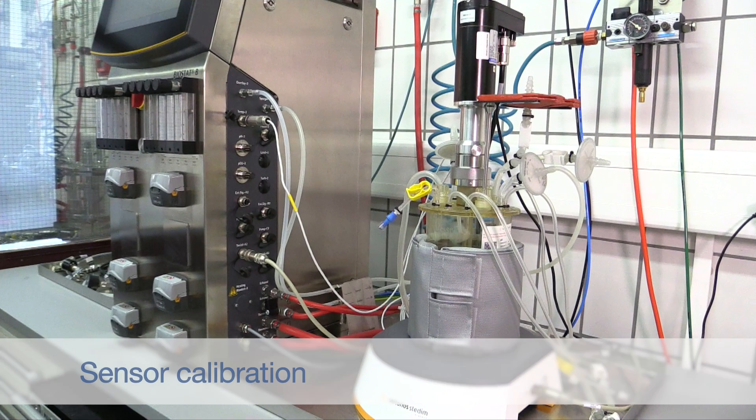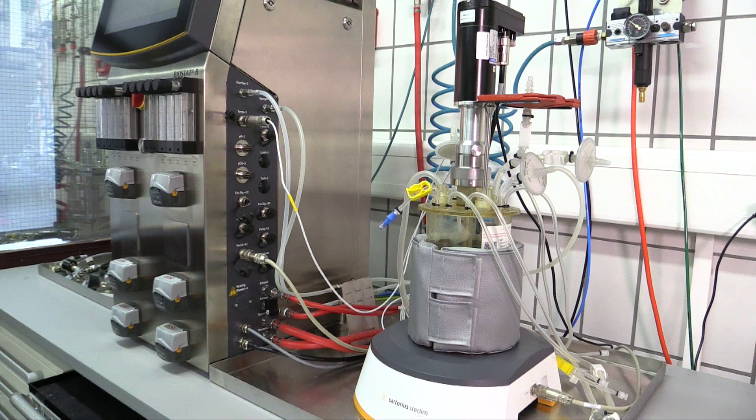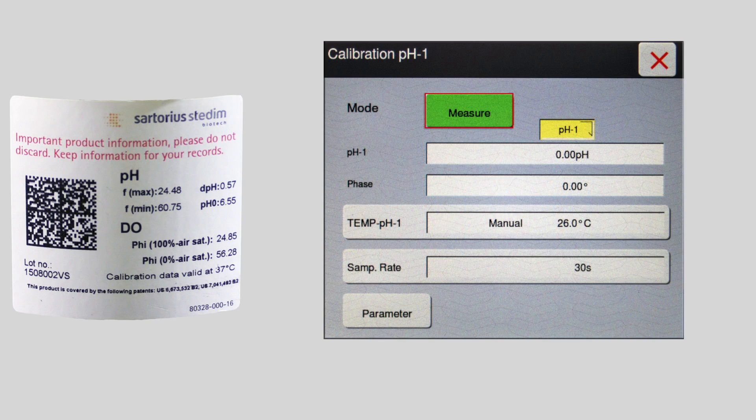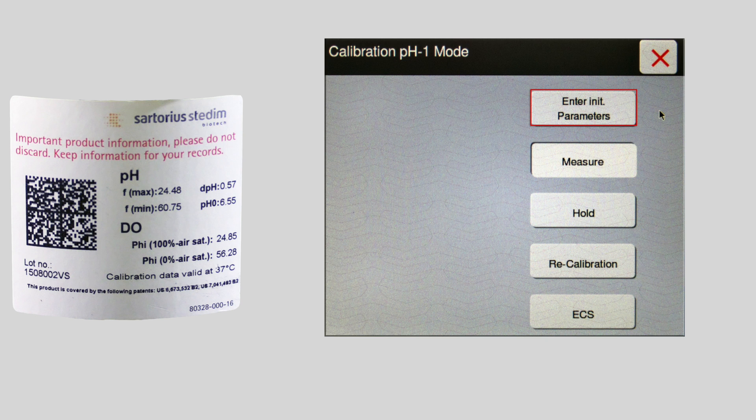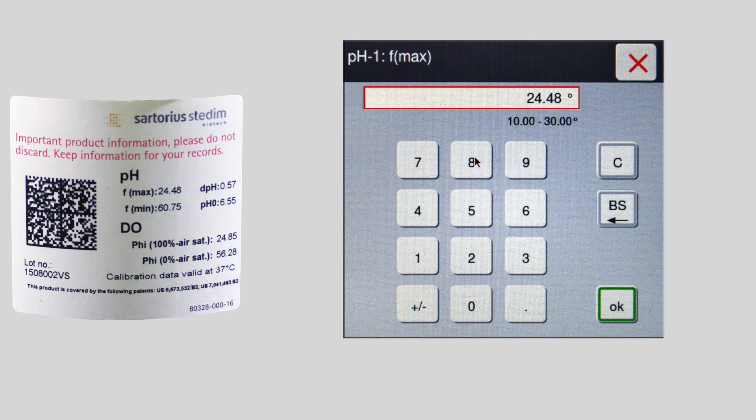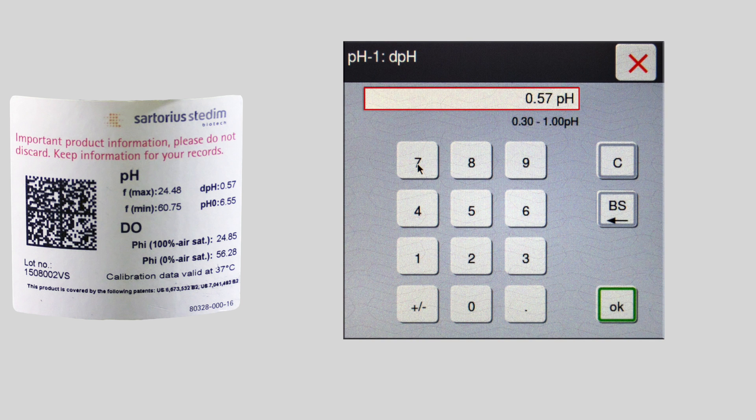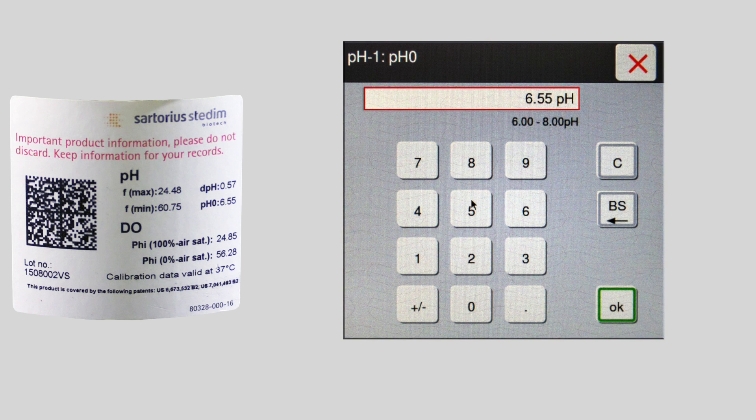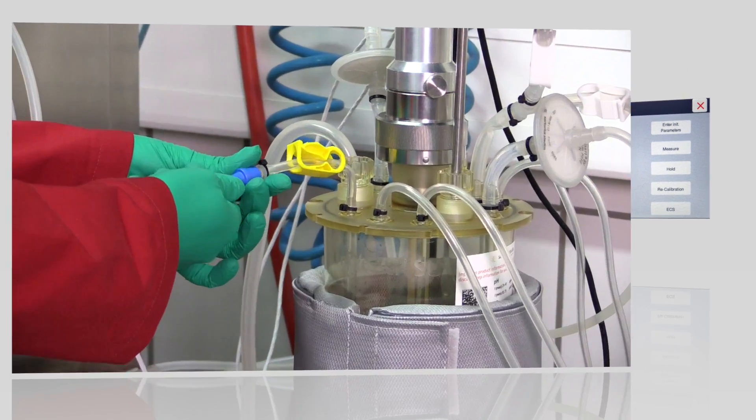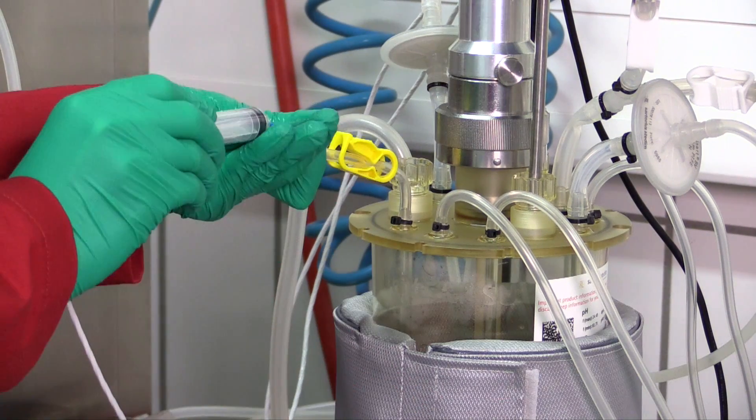When the temperature and process signals are stable, the sensors can be calibrated. The calibration differs from the conventional procedure as sensor patches are integrated into the sterile vessel. The sensor patches are calibrated by the manufacturer and calibration data are delivered with the bioreactor. First, the data from the labels are entered into the control unit.